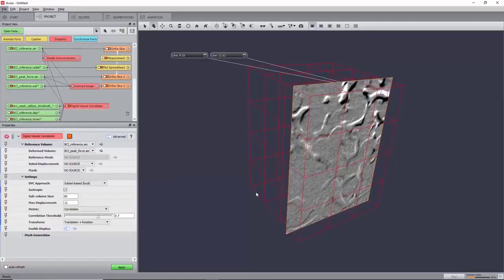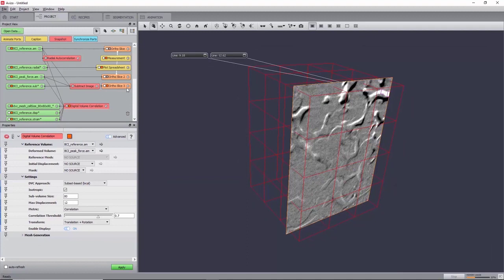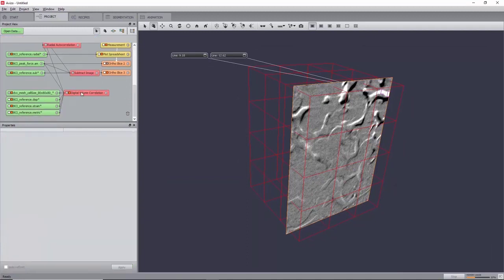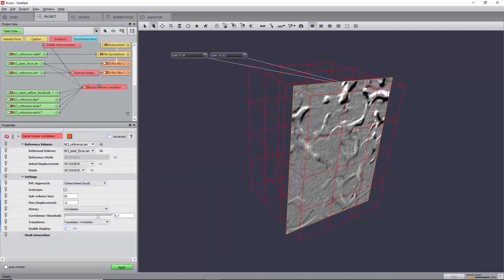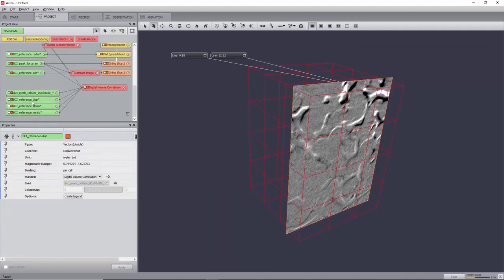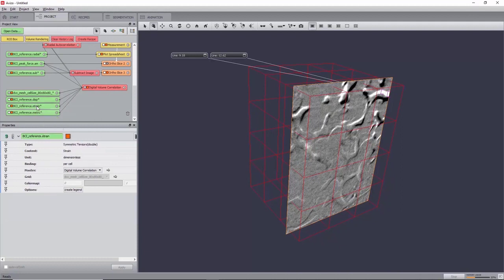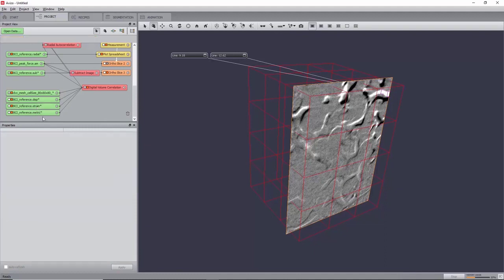Once completed, four new fields will be created. Firstly, a mesh representing the subset, then a displacement field, and a strain field, which respectively store a vector and a strain tensor at the center of each subset. Finally, a metric value is computed for each subset.